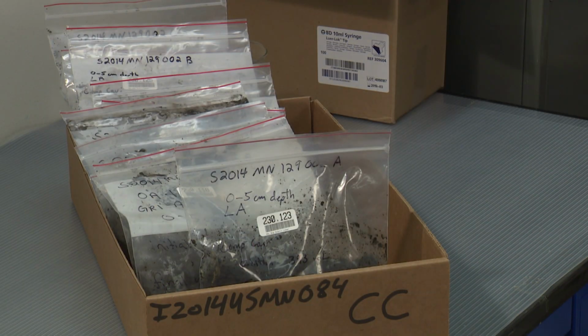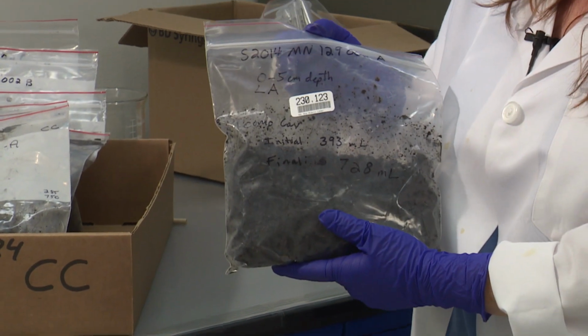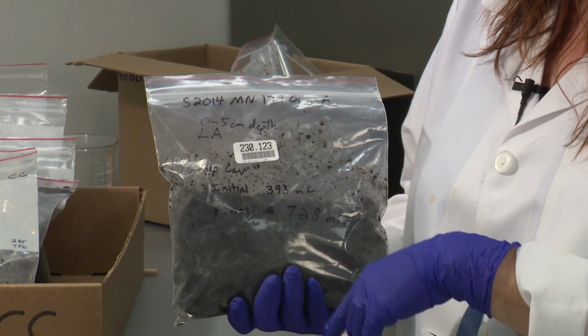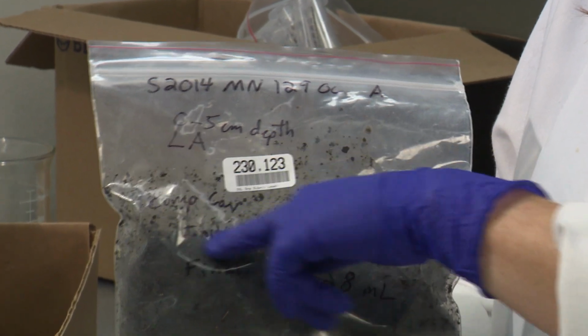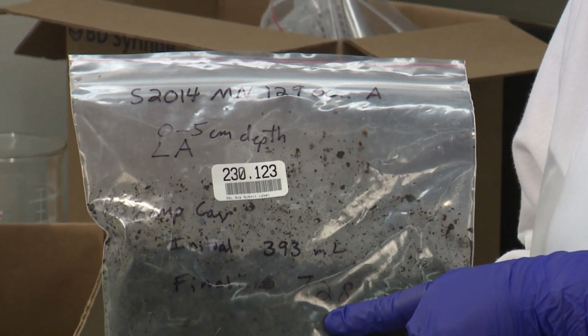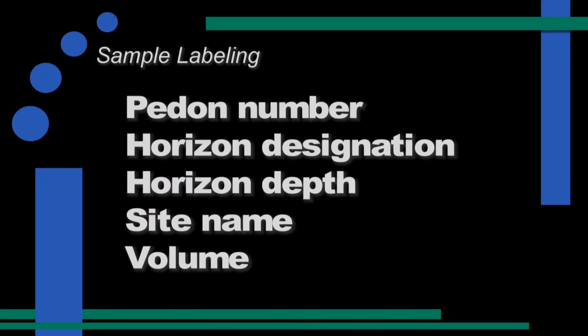Alright, here's an example of bulk density that comes in. We have 3 ways that we can do this. We have either the can method, the core method, or compliant cavity. These samples come in a sealed bag, and the information that we like to see on the front is the pedon number, the horizon designation, the horizon depths, the name of the site, and also the volume of the sample needs to be on the front of this bag. When you take the 3 separate cores from the layer, they need to be individually bagged.